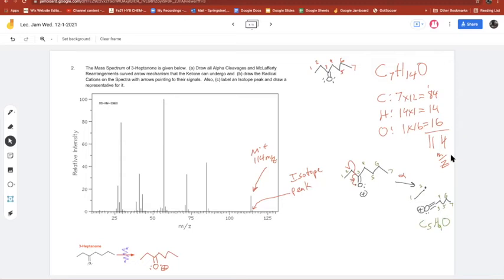Yep. And what is the mass? It's 60 for 12 times 5, plus 9, plus 16, 85 mass to charge. So let's see, do we see an 85? Yes, we do. I see 75, 80, 85 right there. So that's that one.